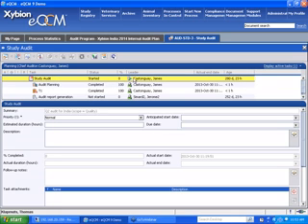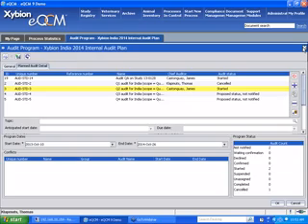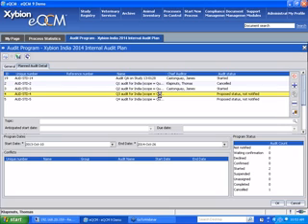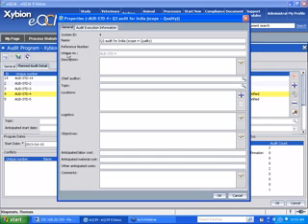If I open it, again, here's the audit planning, the various aspects of it. So again, you can monitor the audit as well. So this one is actually active. And then here's a proposed one, but I didn't send out notifications.